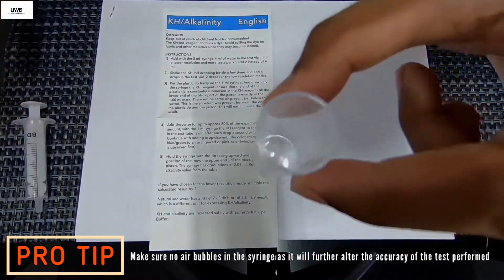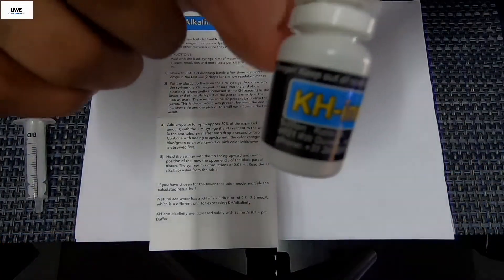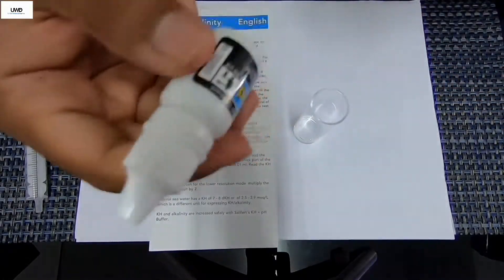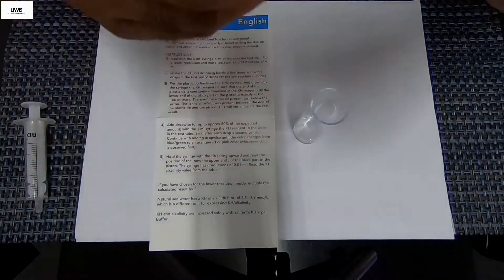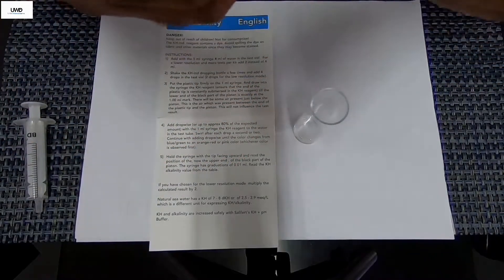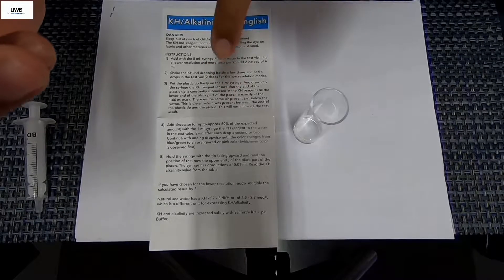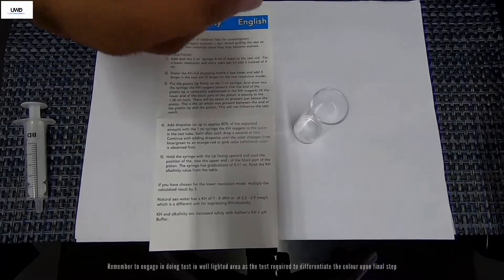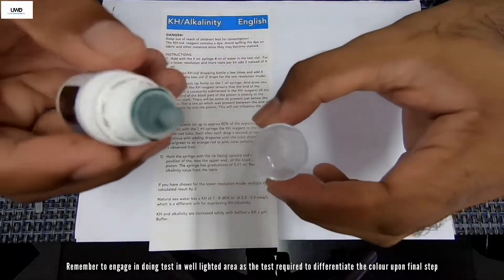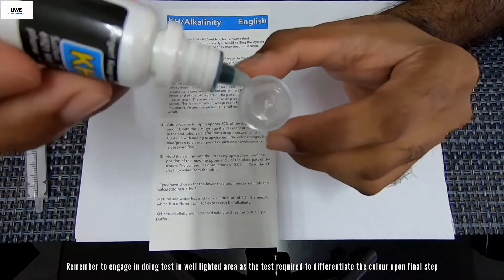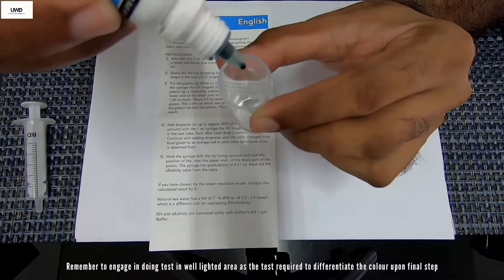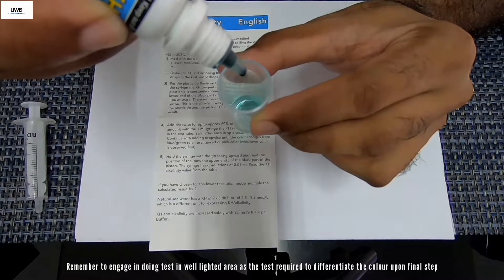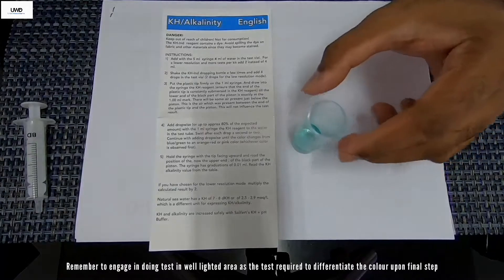Put aside this big syringe. Now we're going to take this KH indicator here, I'm going to give some small shake like this a few times just to mix it up. According to this pamphlet or booklet manual given here, I'm going to be putting four drops. One, two, three, four.